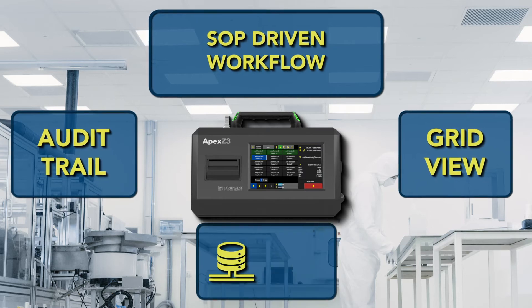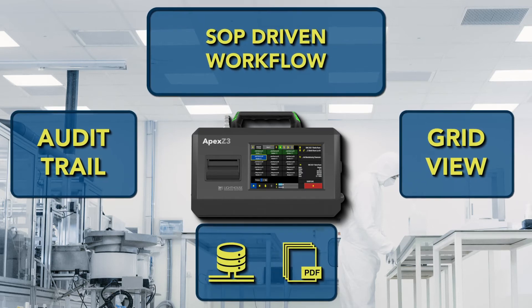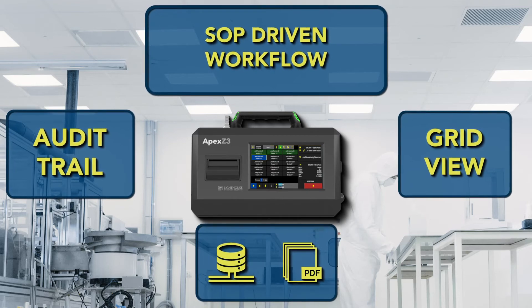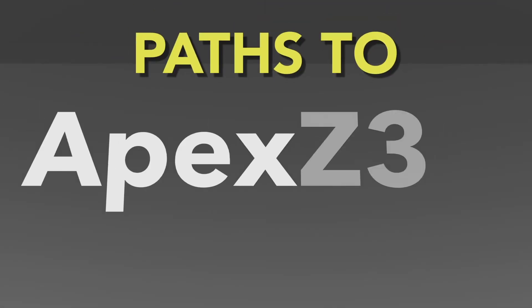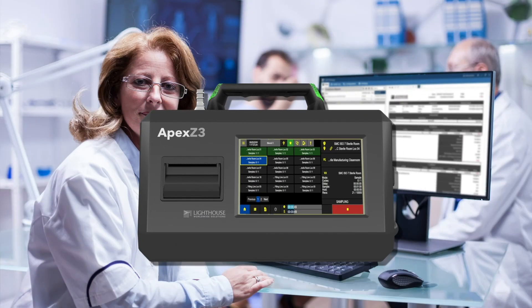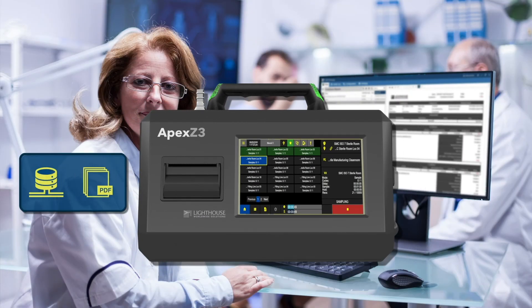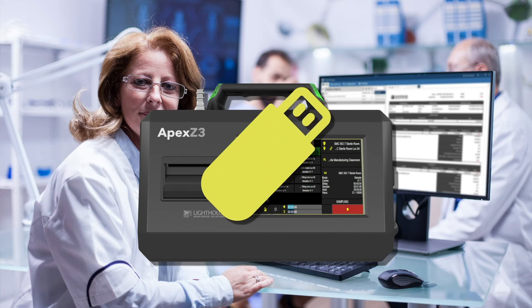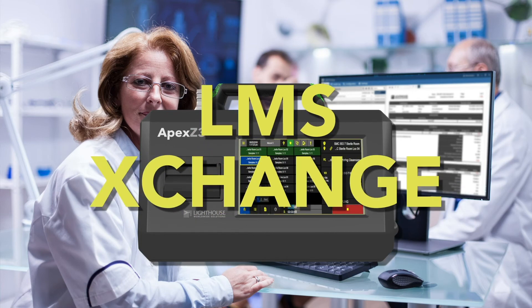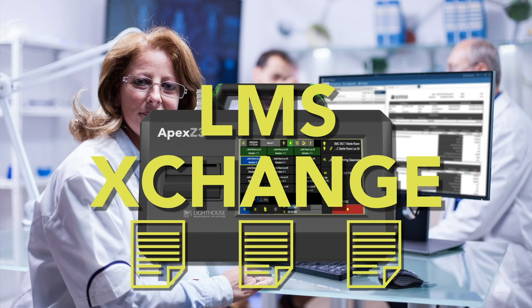Export PDF reports to a secure file server or a networked printer so you have fully traceable GMP reports. The Apex Z was built for paperless data management, enabling several ways to go paperless. Send PDF certification reports over Wi-Fi to a printer or secure network folder. Use a USB flash drive to export your data, or connect your instrument directly to our LMS Exchange data management software. Configure your SOPs and workflows and generate multiple reports from LMS Exchange.